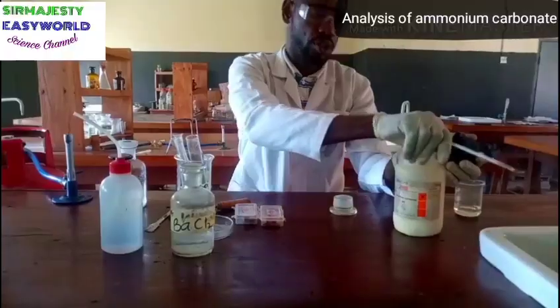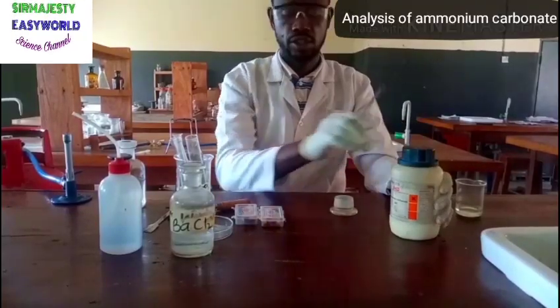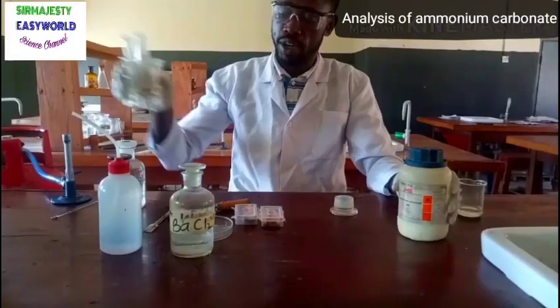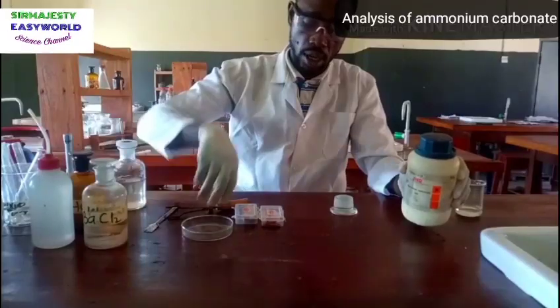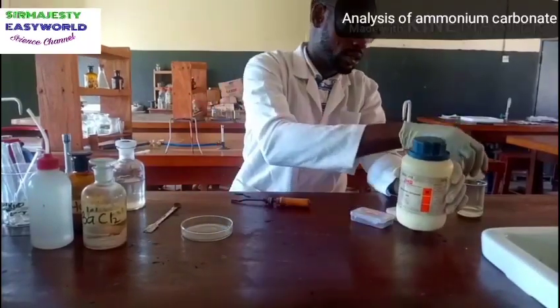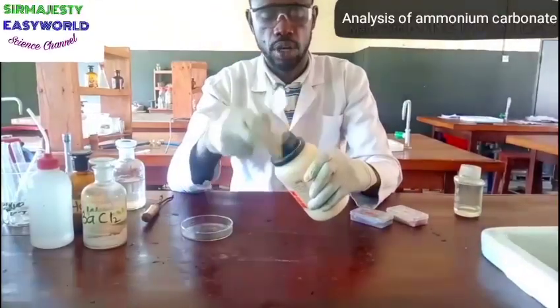Then, for exam purposes, your examiner might ask you in a stepwise reaction to get a sample, because you shouldn't be analyzing everything in this way. I will collect a sample first. So with my spatula, I'll get a sample of this ammonium carbonate.